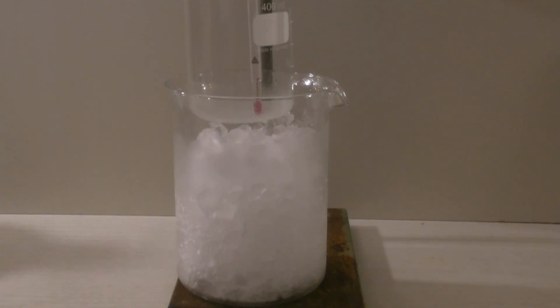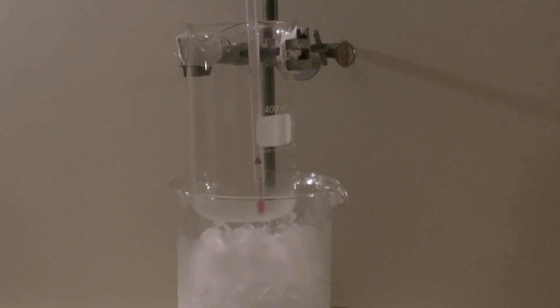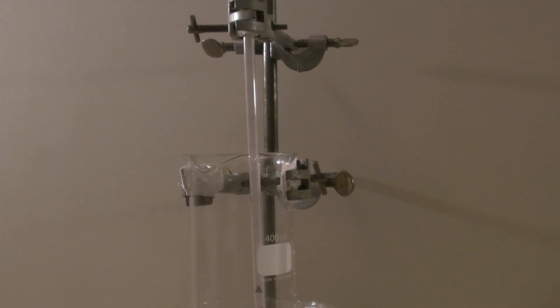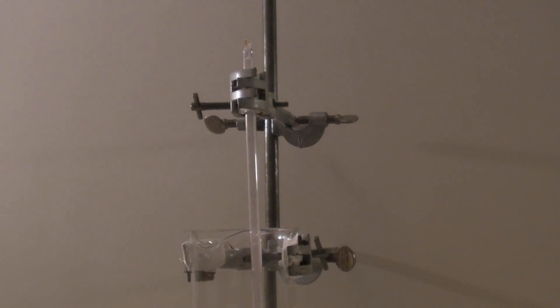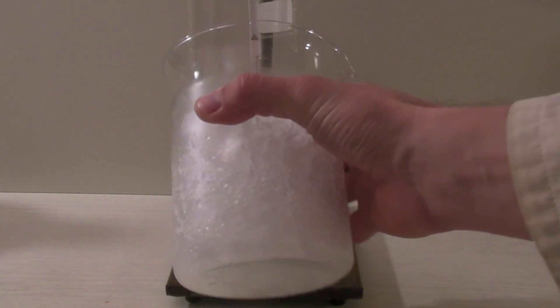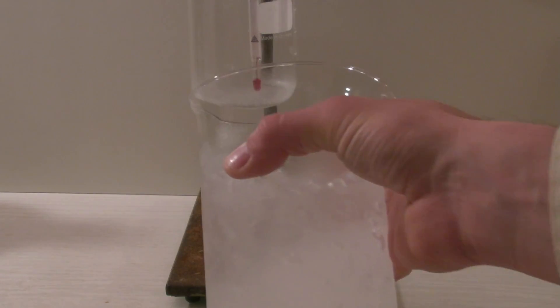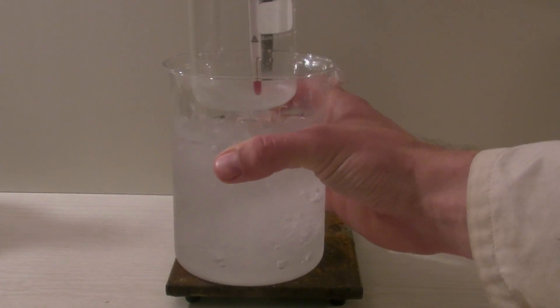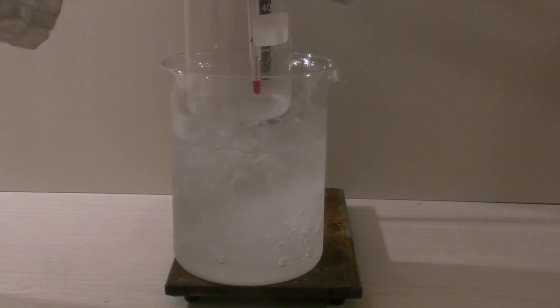For the synthesis a beaker is attached to a ring stand and cooled with an ice bath. A thermometer is hanging into the beaker to keep track of the temperature. It is best to add only a small amount of water and a large amount of salt at the beginning. The thermometer should be placed as close as possible to the wall of the beaker without touching it.